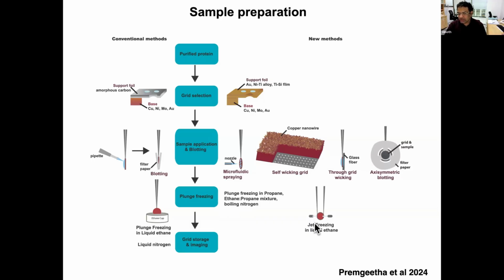that it freezes fast. So some of these ways of freezing come also from X-ray crystallography, because jet freezing, or using a jet to freeze, is known for crystals in X-ray crystallography. So the most common is this conventional way. You have a Vitrobot, you just do it very fast. You can freeze the grids in maybe 20 to 30 minutes.